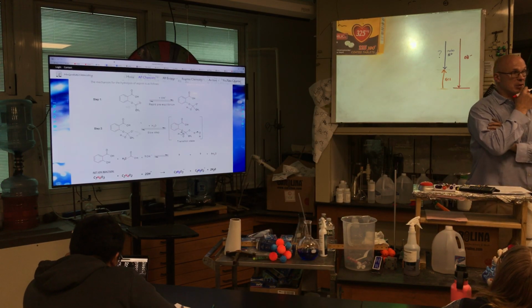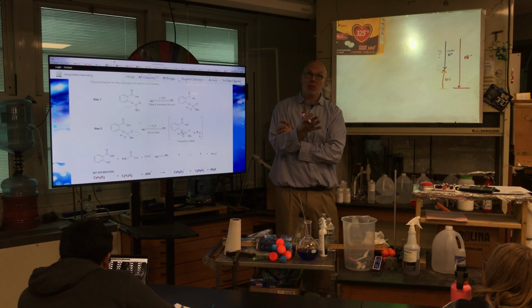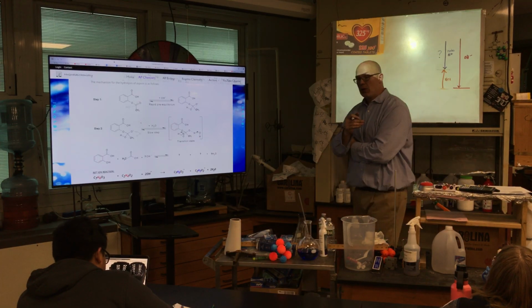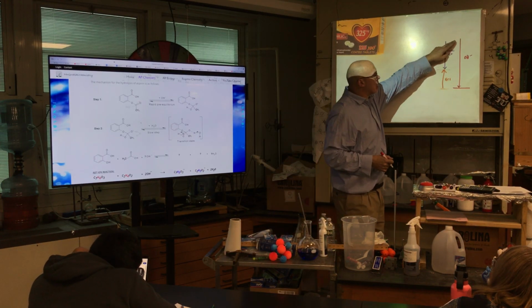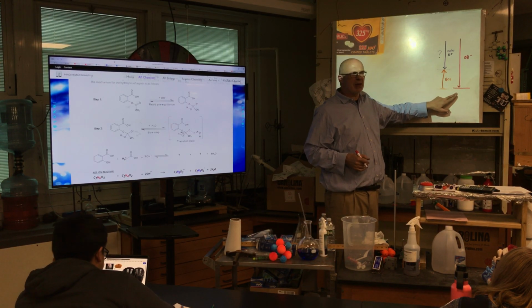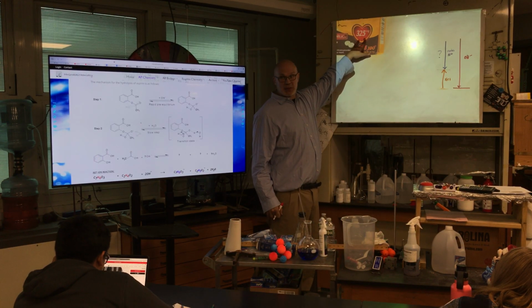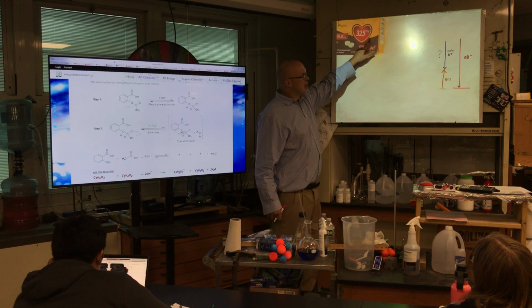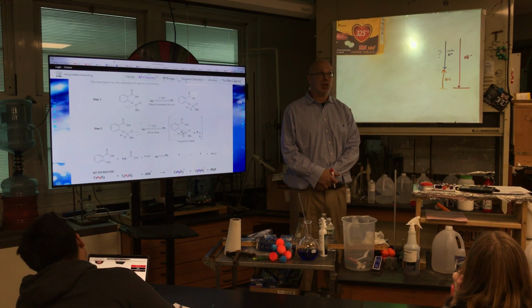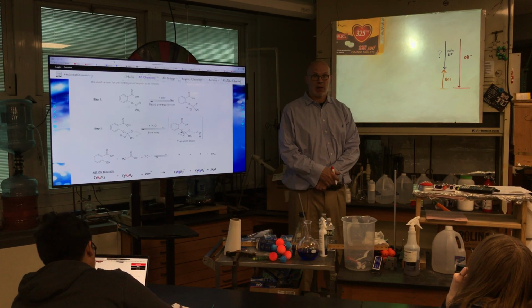We're going to add a strong base, correct? Because it's a strong base, it reacts with the CO2 in the air and the water in the air. It's deliquescent, very reactive. For me to figure out the total moles of hydroxide, I'm going to use a value that's estimated based upon the starting amount of milligrams as my target. This arrow down is going to be adjusted. It was adjusted in your form last night. It's adjusted here. Okay, let me explain.